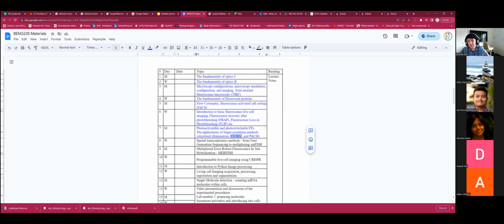The reason it was developed there is that there's an intimate relationship between how you do super resolution imaging, how you can take some of those concepts and bring them to multiplex imaging, which is MERFISH, and how you can push those components even further to live cell imaging. This is the very frontier of where people are trying to go on the technology side. It's very difficult, but hopefully it gives you some perspective on how this is being developed, with some background of all of these techniques, which hopefully will be useful.